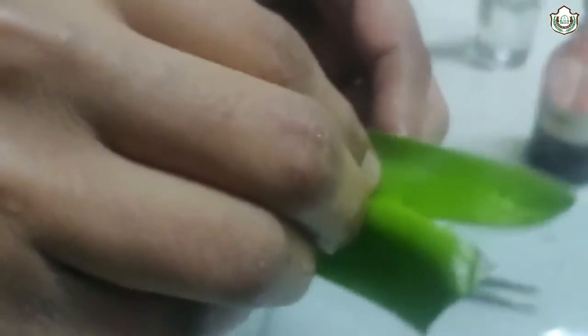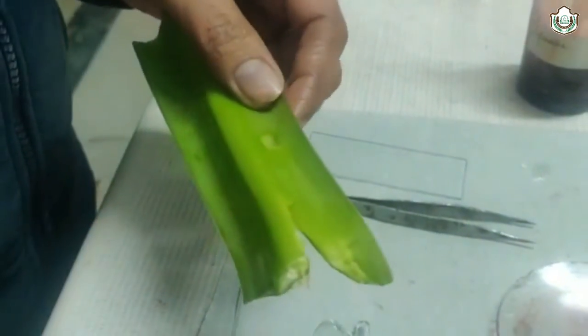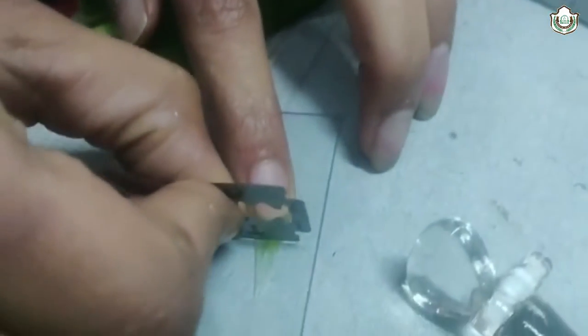First of all, we have to take the peel. Take the peel and cut it with the help of scissor or blade in square shape.